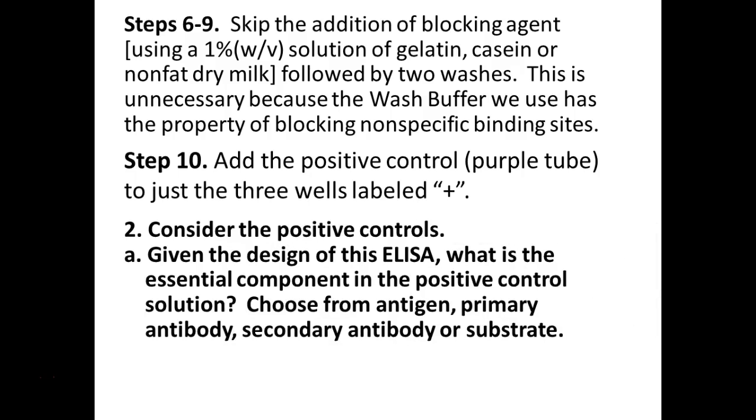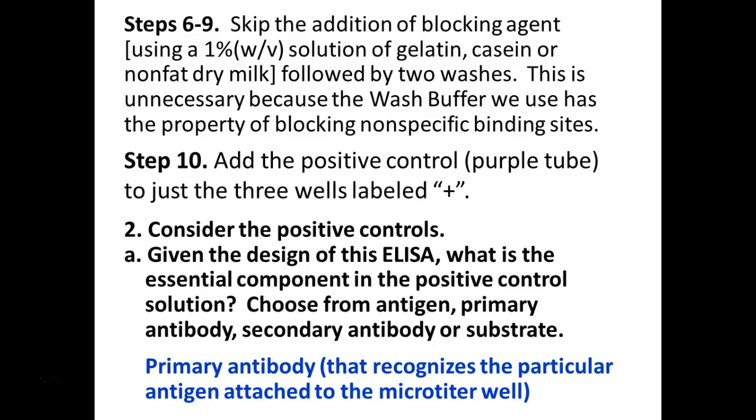These are our positive controls. Why would you want to do a positive control? I just answered this one though, right? What are we putting in there? What are we testing for today? The primary antibody, right? That's what our positive control is going to have in it. Why are we doing positive controls?